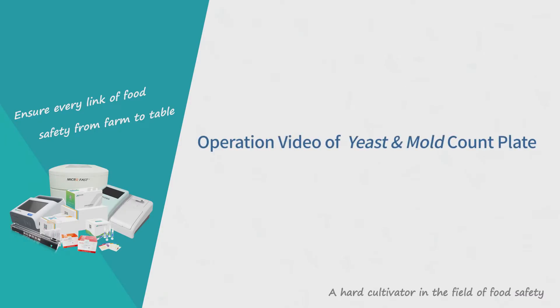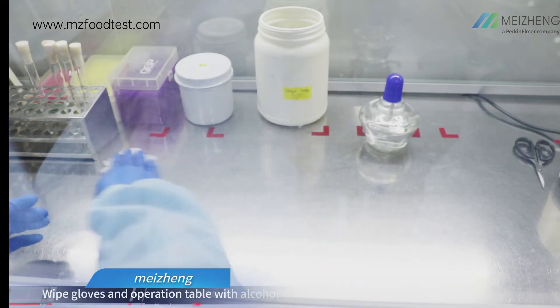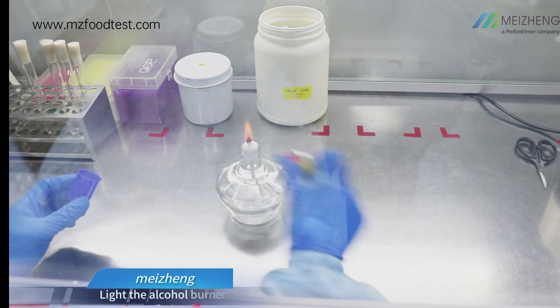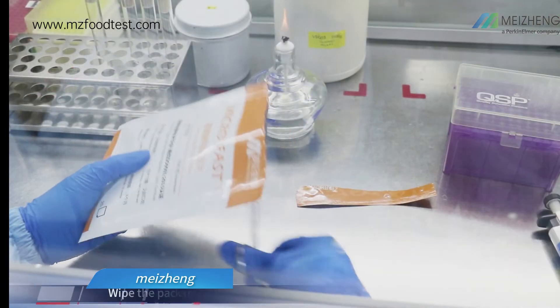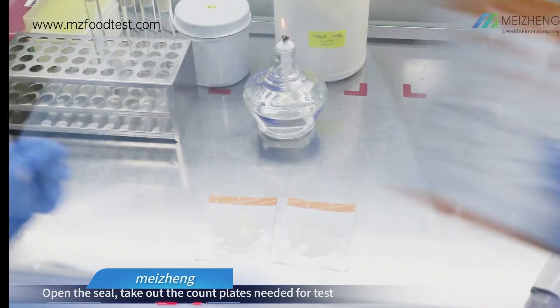Operation video of Yeast and Mold Count Plate. Wear lab coat, mask, and gloves. Wipe gloves and operation table with alcohol cotton ball. Light the alcohol burner. Wipe the packaging, open the seal, and take out the count plates needed for the test.